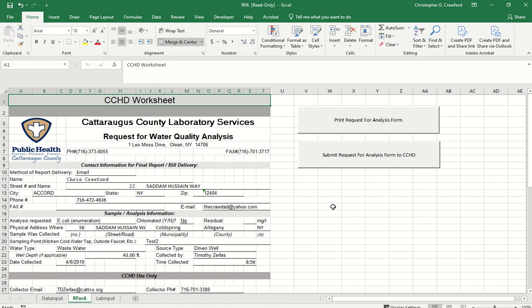And that's all the lab has been doing to handle that. But now the lab's not going to do it. You're going to get a pop-up box that's going to tell you, oh, you need to do this. And the sanitarians will be doing that, which actually makes sense, so the sanitarians know what one is what. So that's how we're handling that now. So you got the path name issue, you got the overwrite issue with the same sample, the same location, and the same date. Those have been handled.